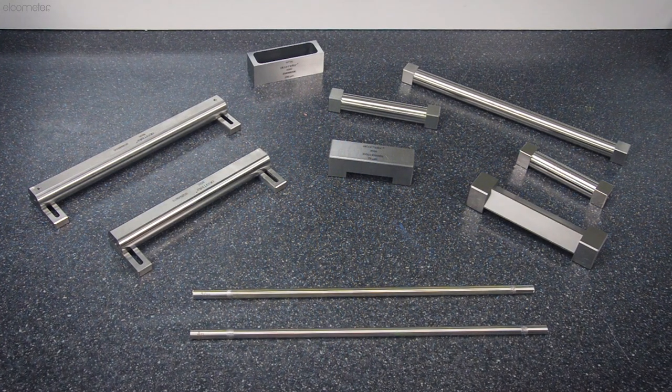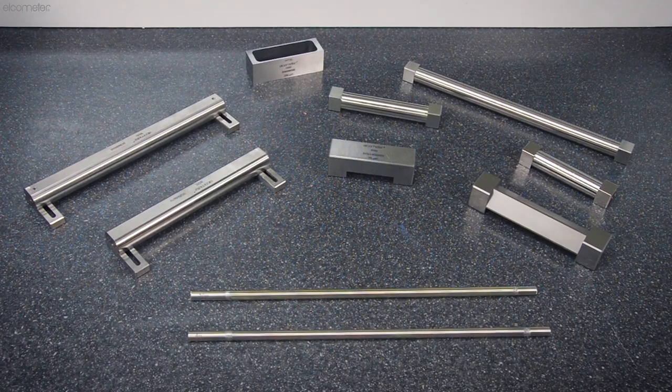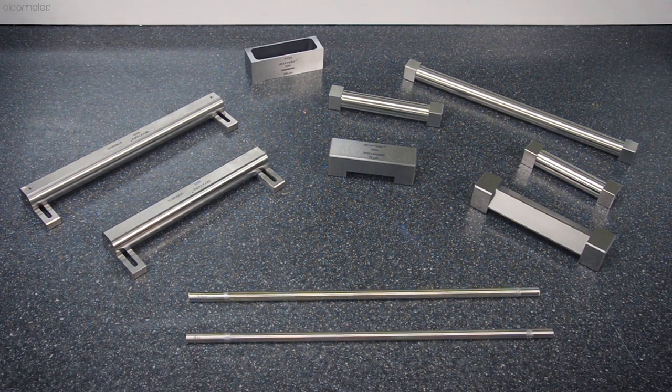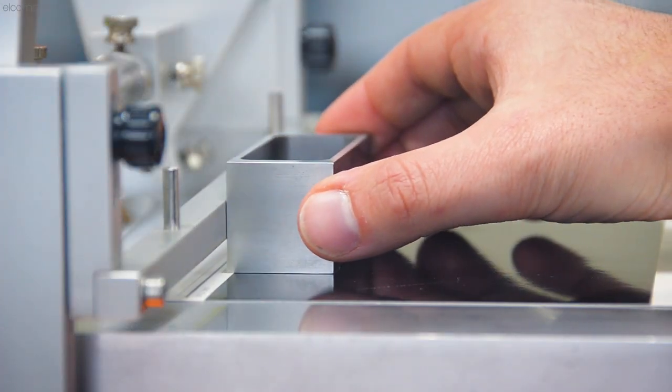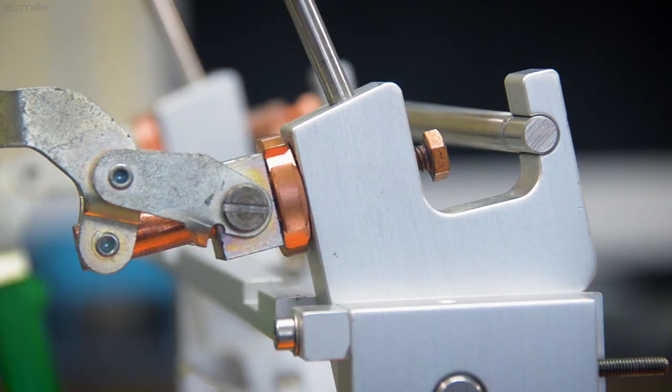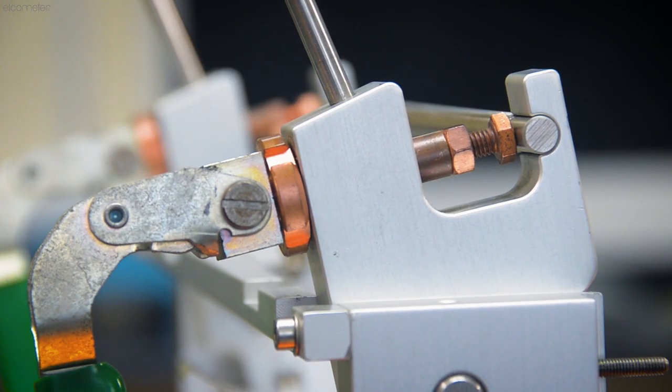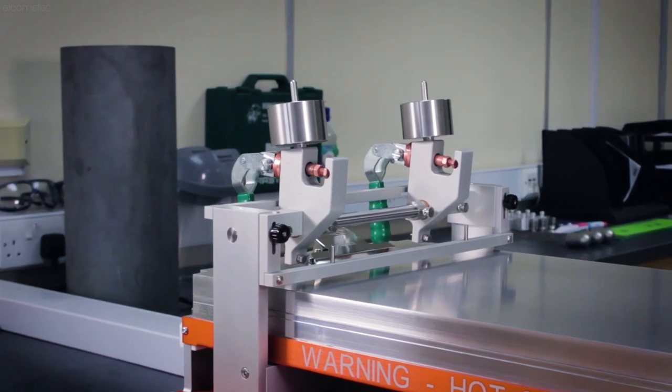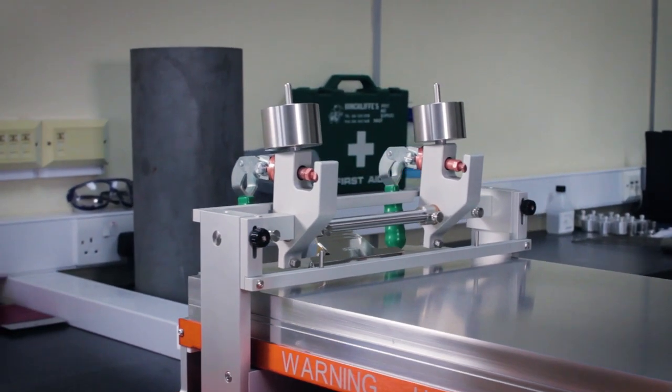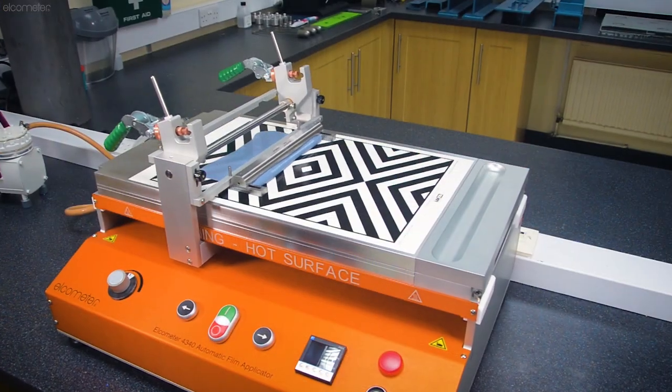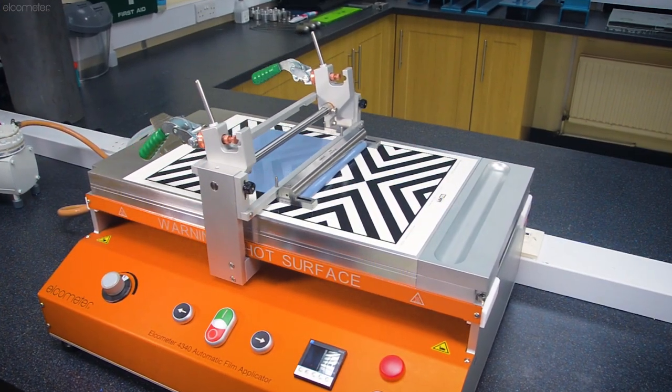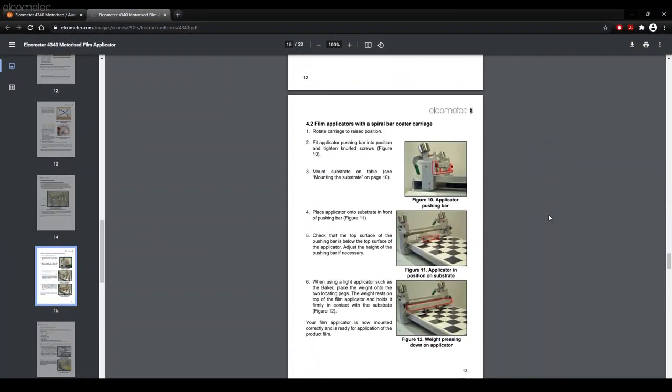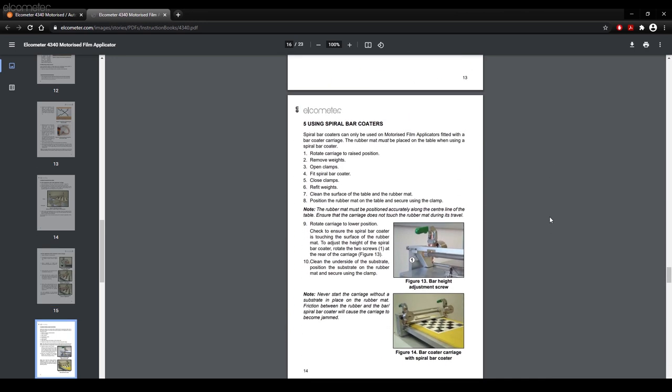With your substrate mounted, it's now time to add your chosen applicator to the carriage. There are three types of carriage: a film applicator carriage, a spiral barcoder carriage, and a combined film applicator and spiral barcoder carriage. As the Elcometer 4340 comes with a combined carriage as standard, we'll be looking at testing with one of those in this video, but full instructions for each carriage type are available in the Elcometer 4340 instruction manual on the Elcometer website.